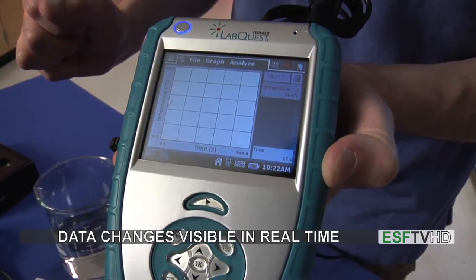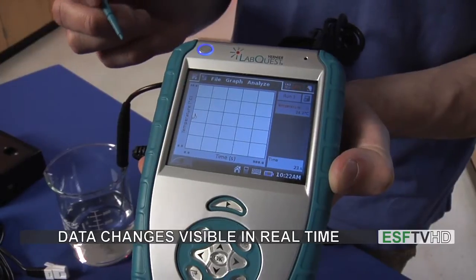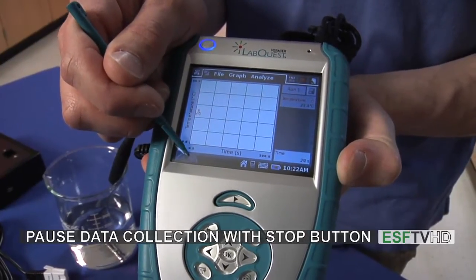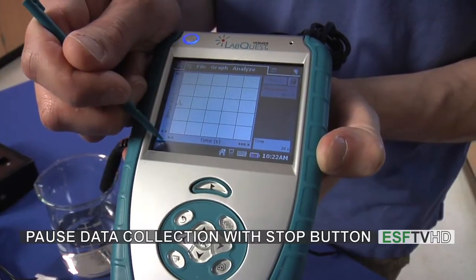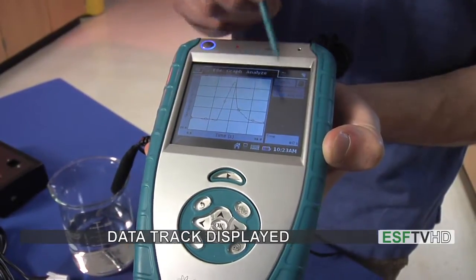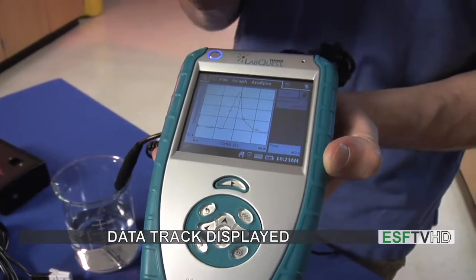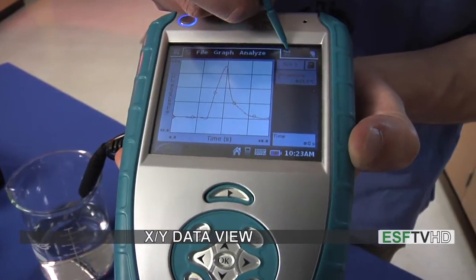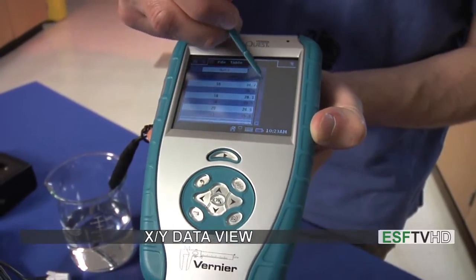And if I put it back into the water I can see it go back. This may not zoom in very much right now. When the experiment is all done — either at the end of the 500 seconds or when you decide the experiment is done — you can hit the stop button, and when you tap the stop button it will actually stop the data acquisition. We can see very close up in the zoomed in view what happened when I took it out of the beaker and put it in my hand. We can also tap a small box on the top which says XY, and we can look at the XY data — time versus temperature in a very nice table.